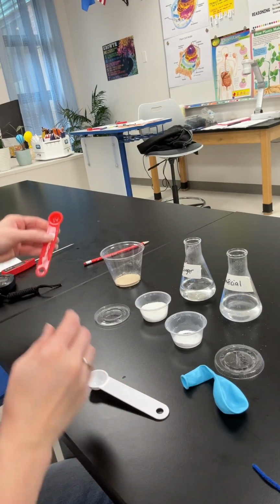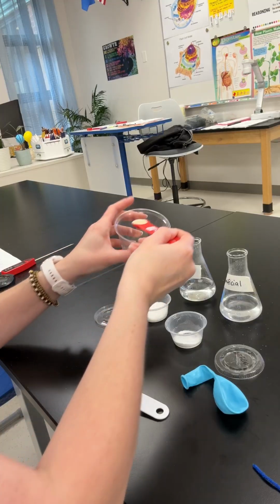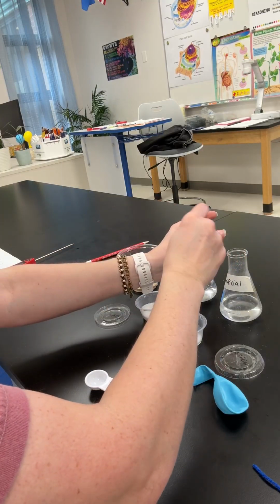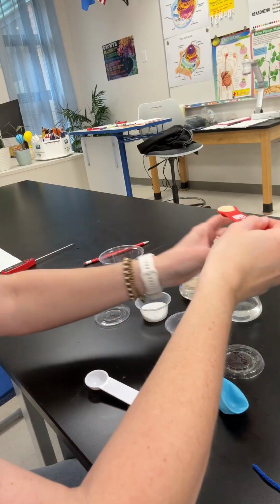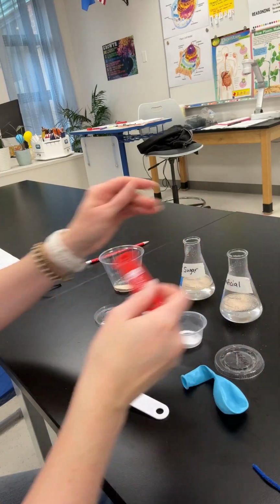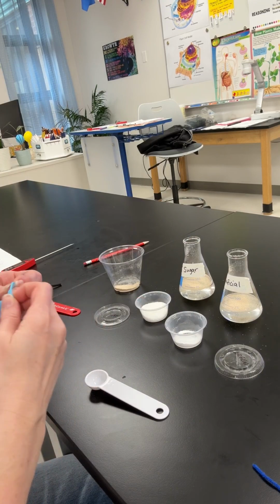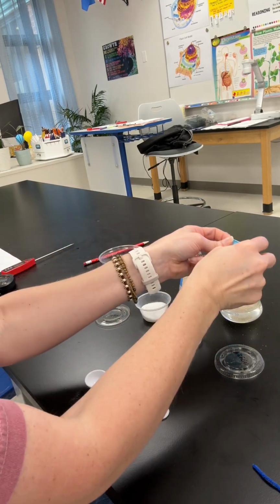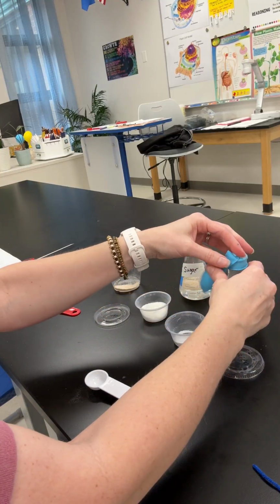I'm going to do a half a teaspoon in each of them. Then I'm going to put a balloon on each of those. This is to help us capture the carbon dioxide gas.